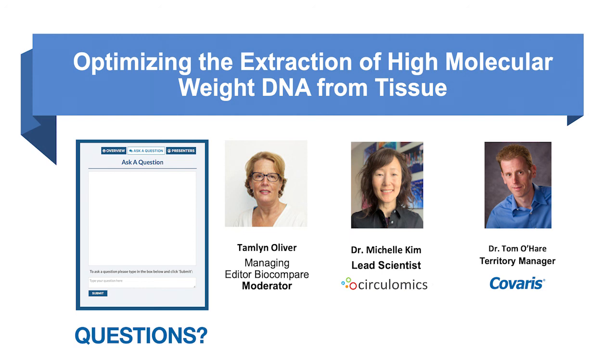Okay, thank you. The next question is, what is the size of DNA with Nanobind? That will vary from tissue to tissue. Generally, we see DNA spanning about 50 kb up to hundreds of kb. With slightly altered processing, you can get it to almost a megabase. Again, that will definitely depend on the tissue type, but I would say generally 50 to 300 is what you can expect.